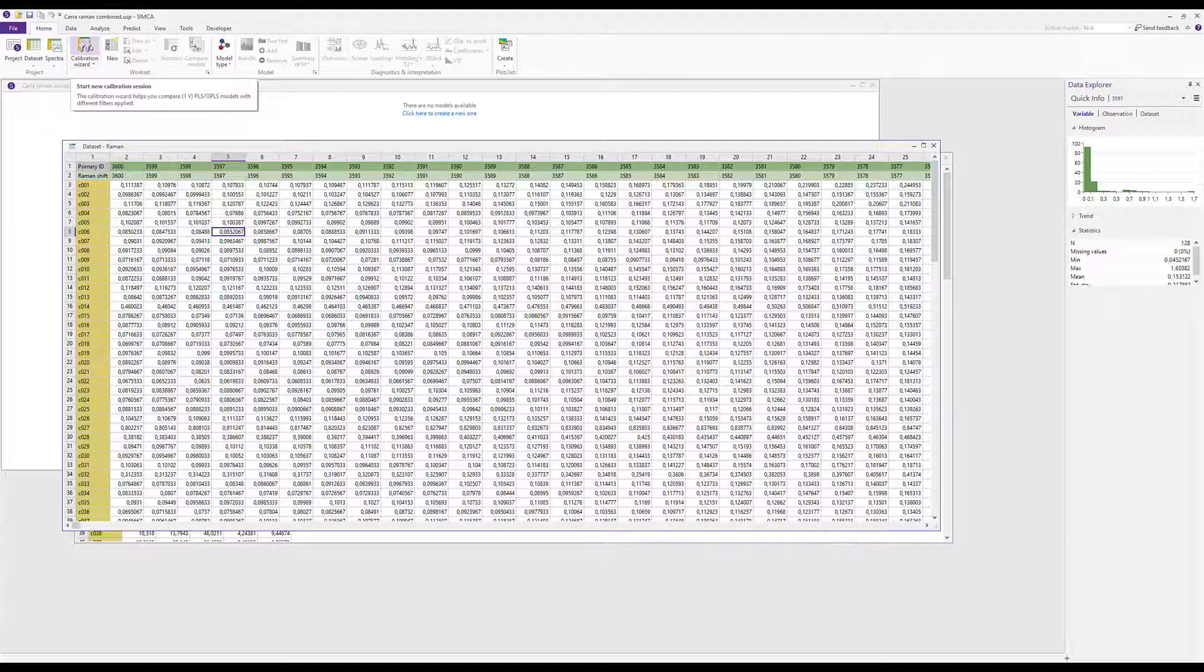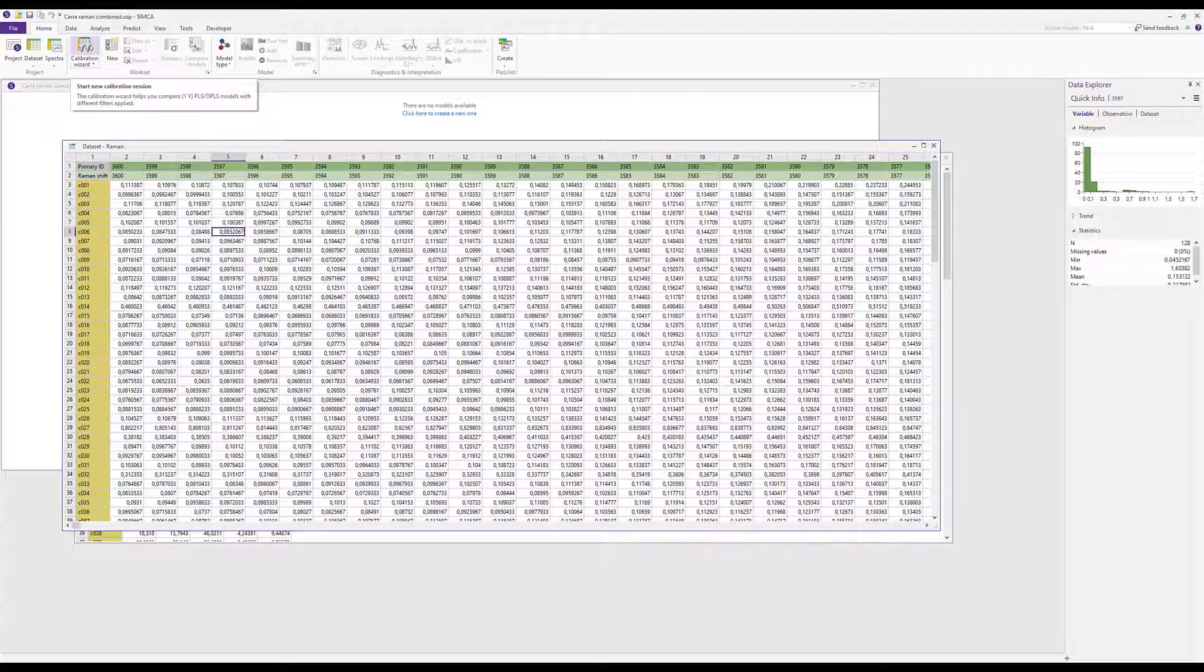The calibration wizard is a special wizard for creating and comparing 1y calibration models that is described in detail in a special SIMCA 17 feature video.